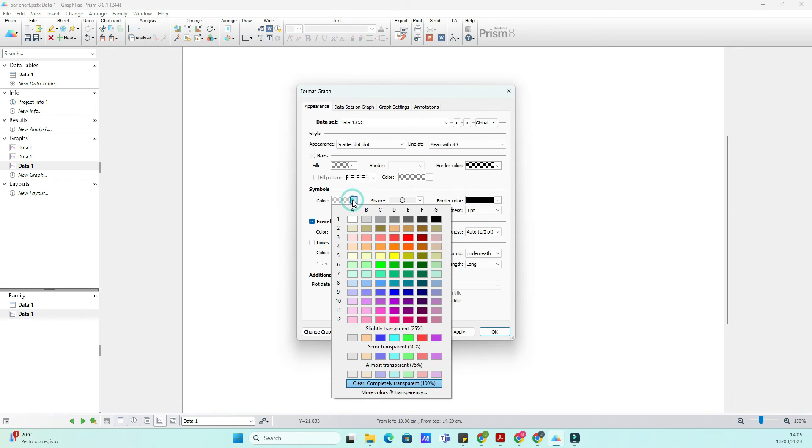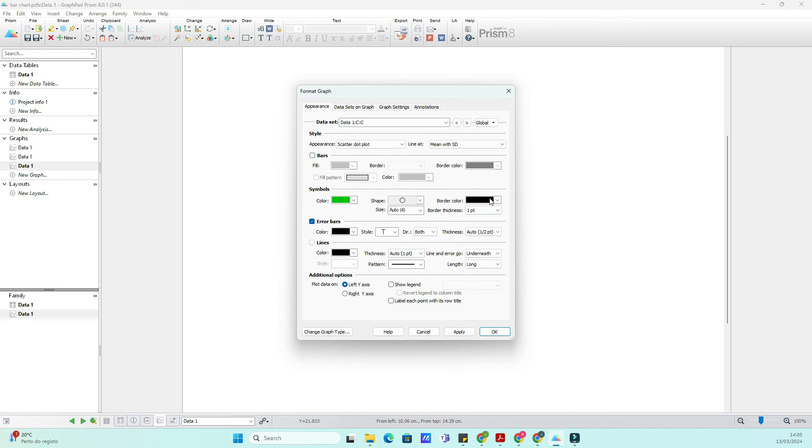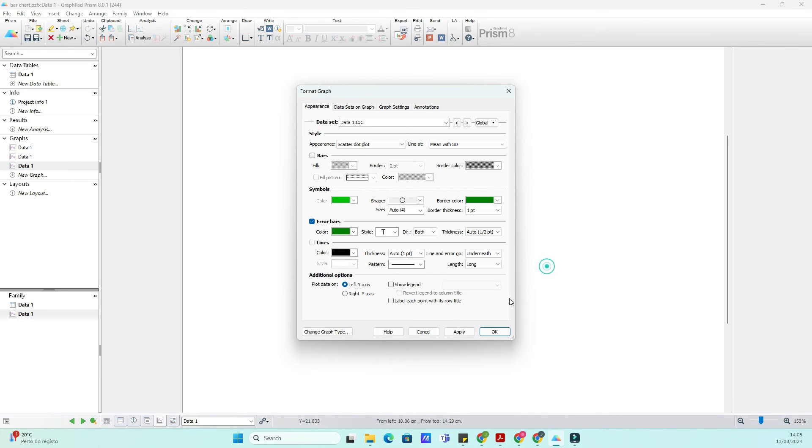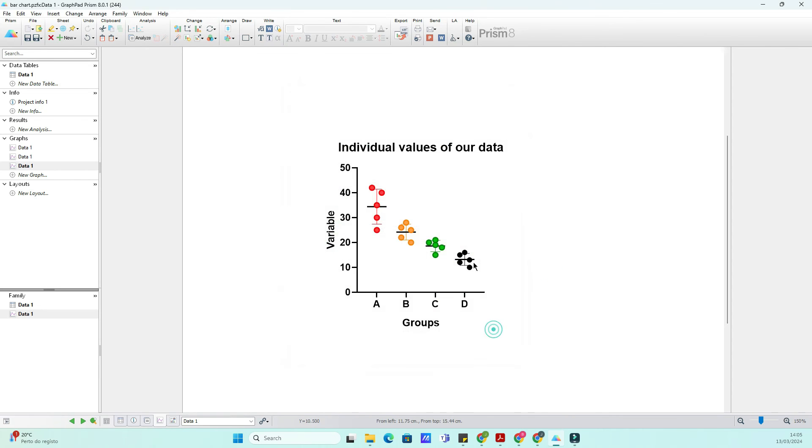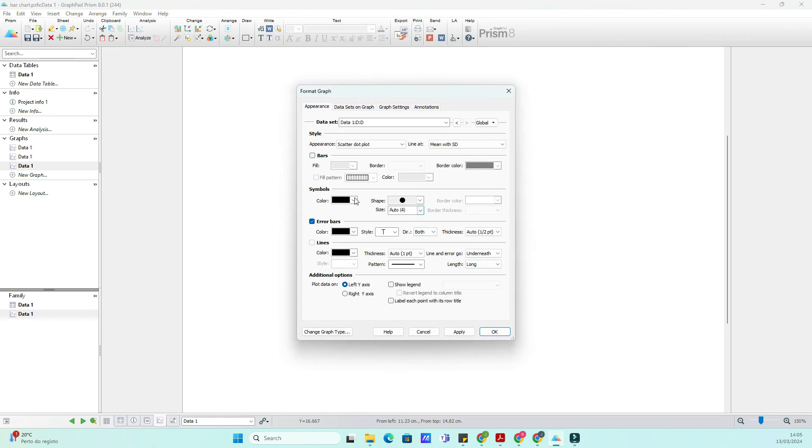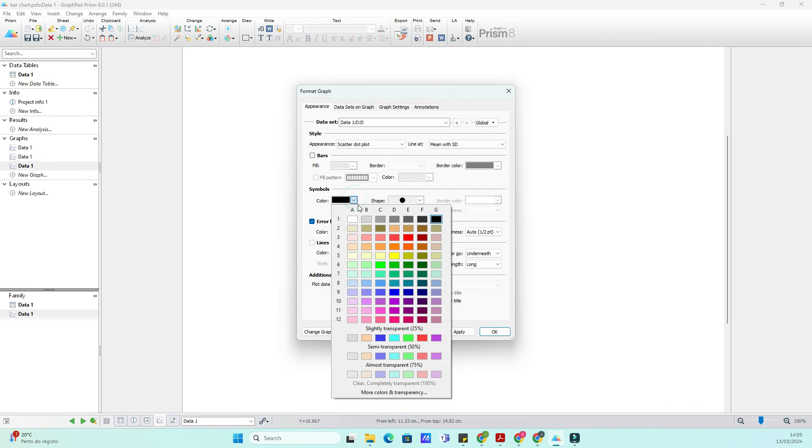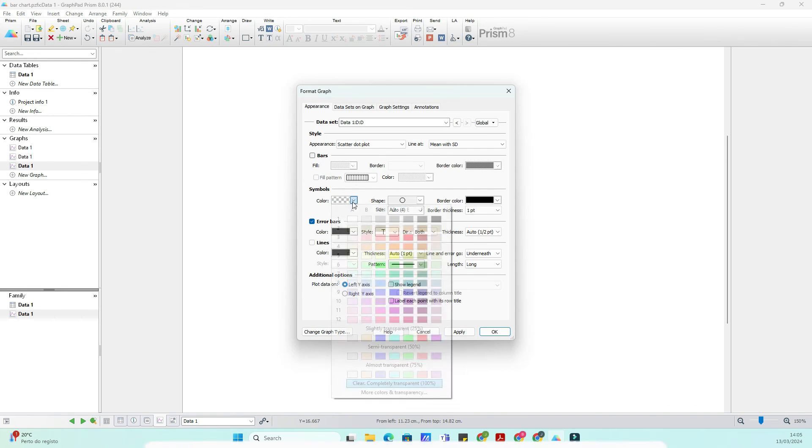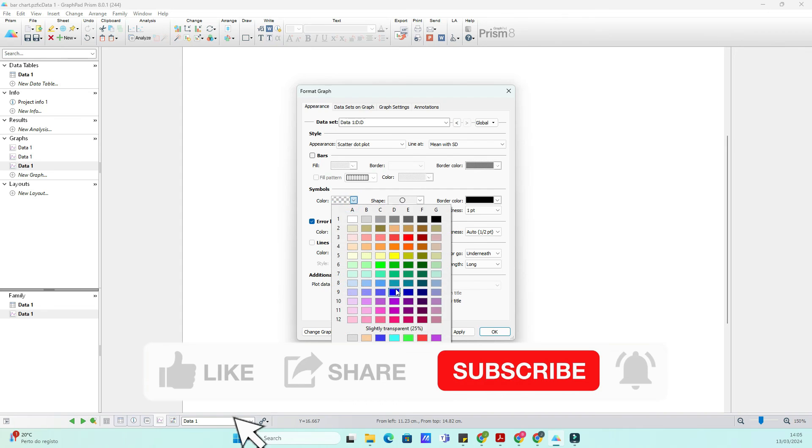And there you have it. With GraphPad, creating stunning individual value plots is not only easy, but also incredibly rewarding. Experiment with different customization options to find the perfect balance of aesthetics and information.